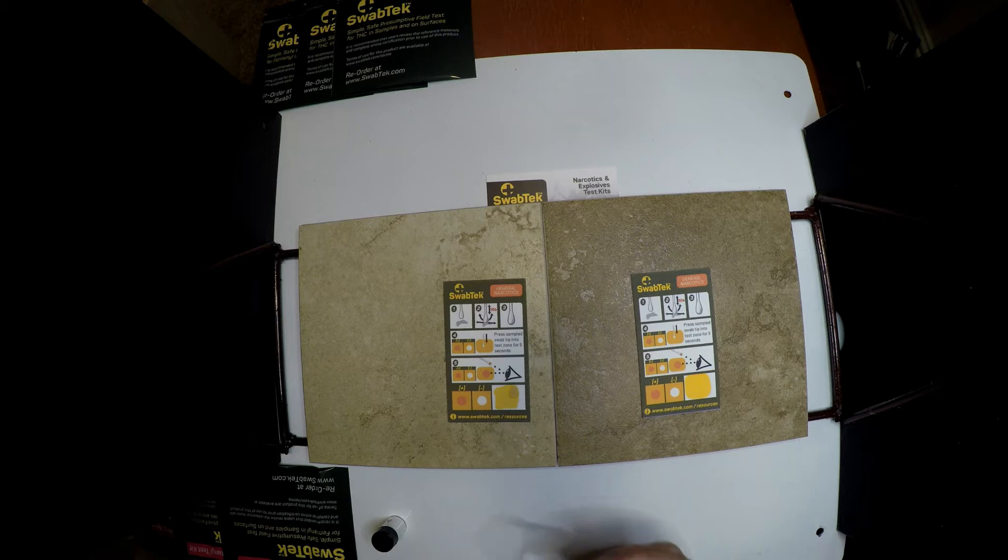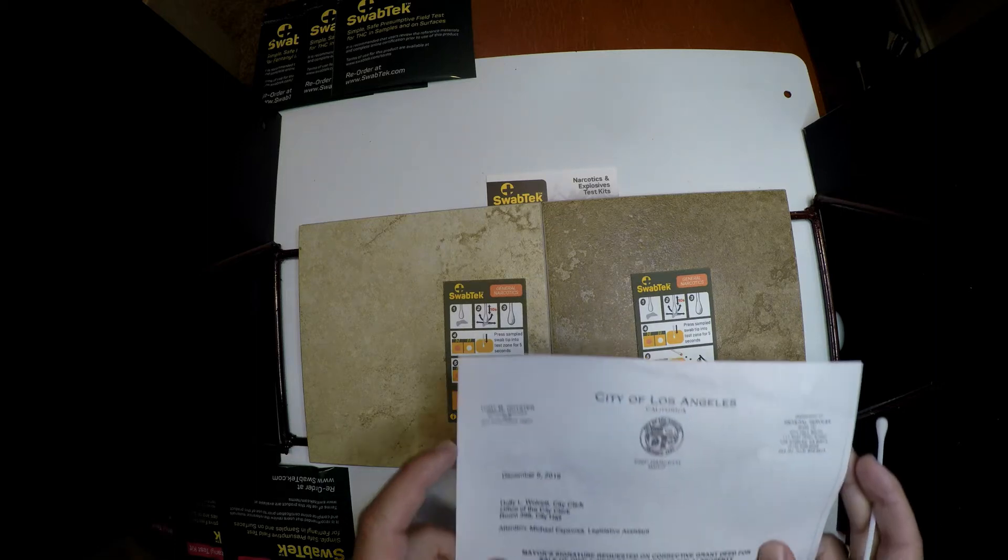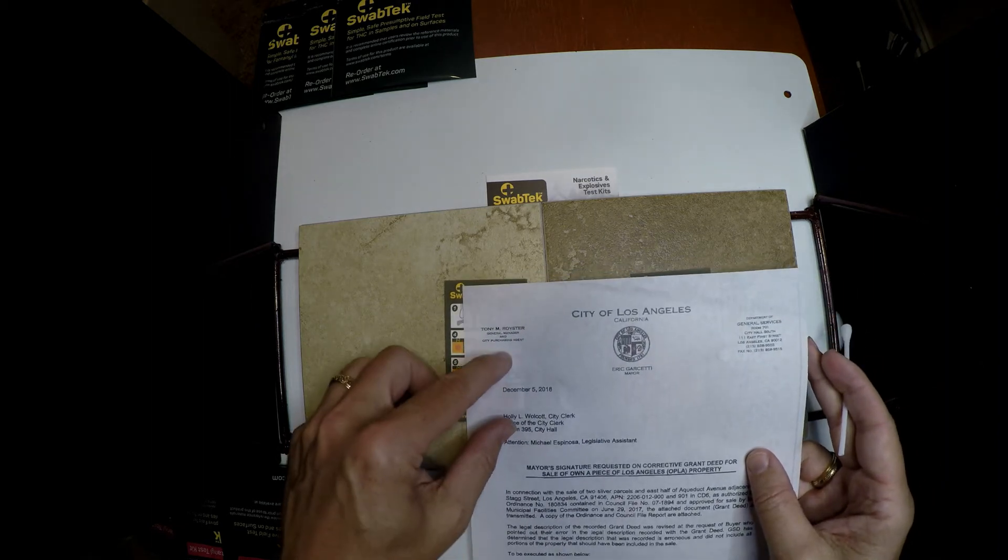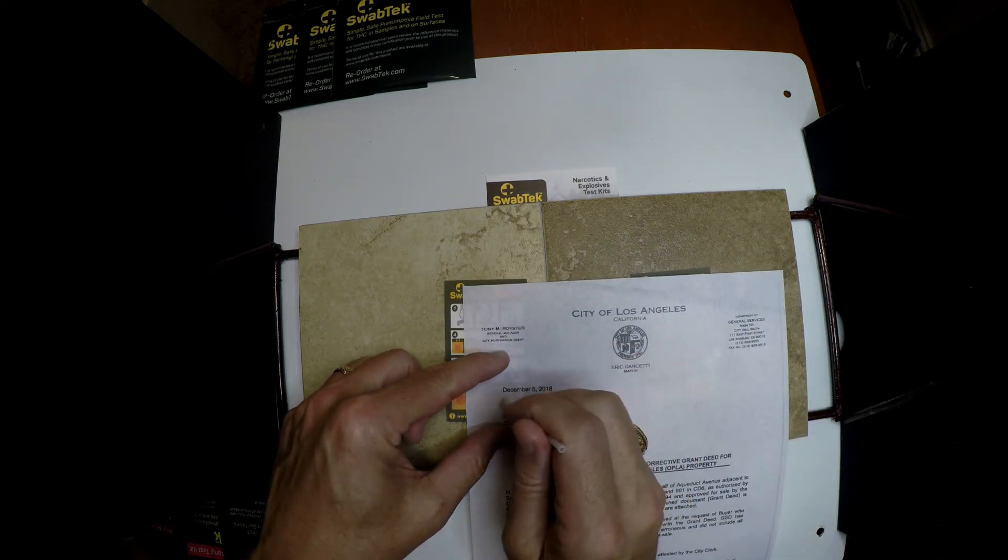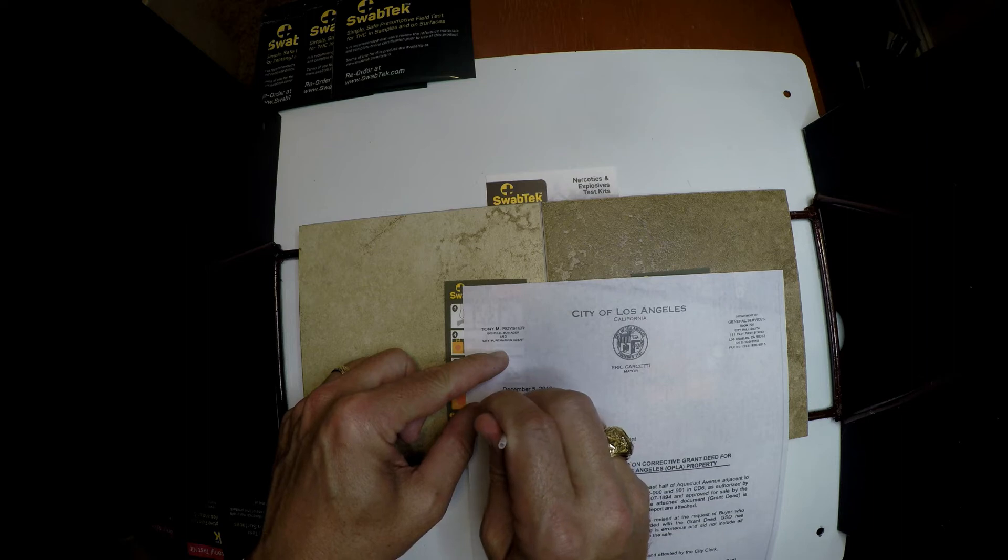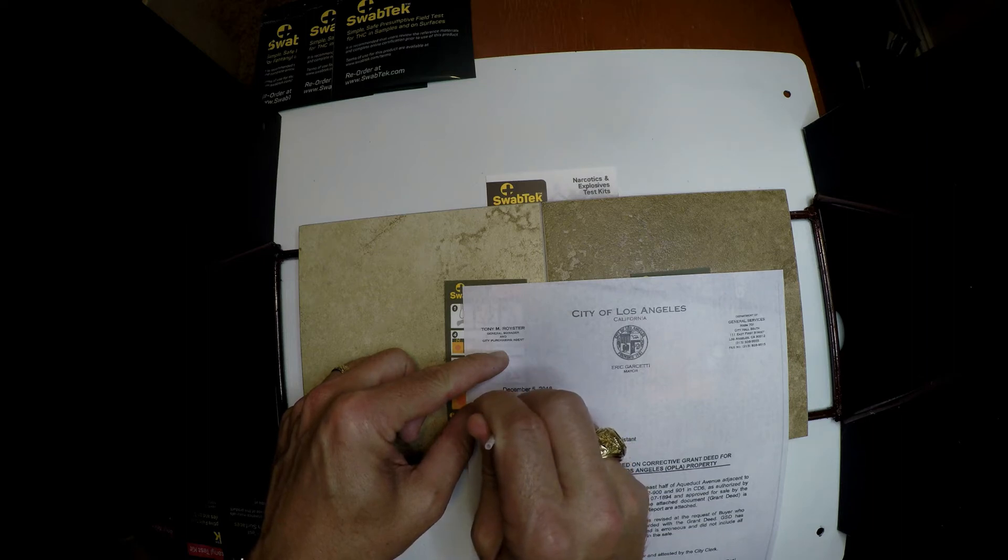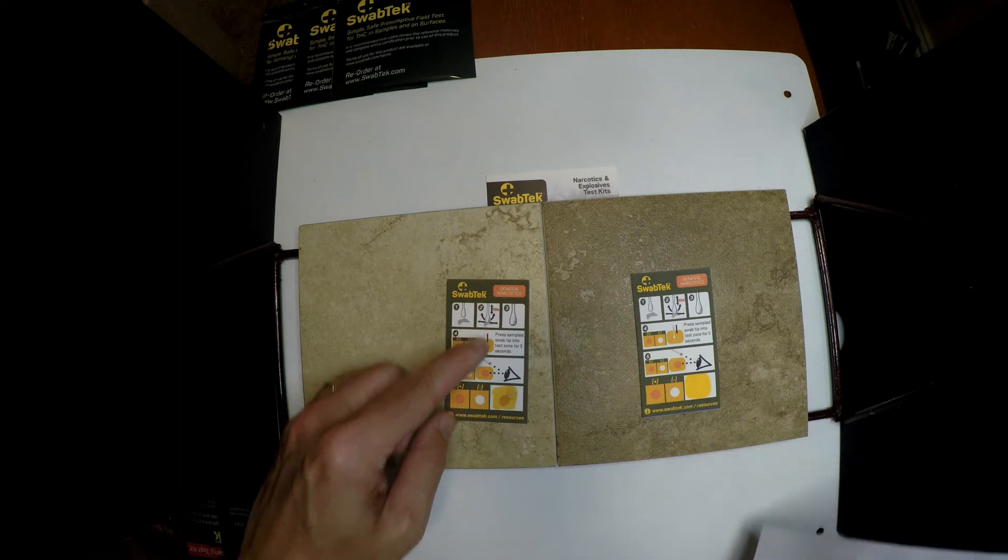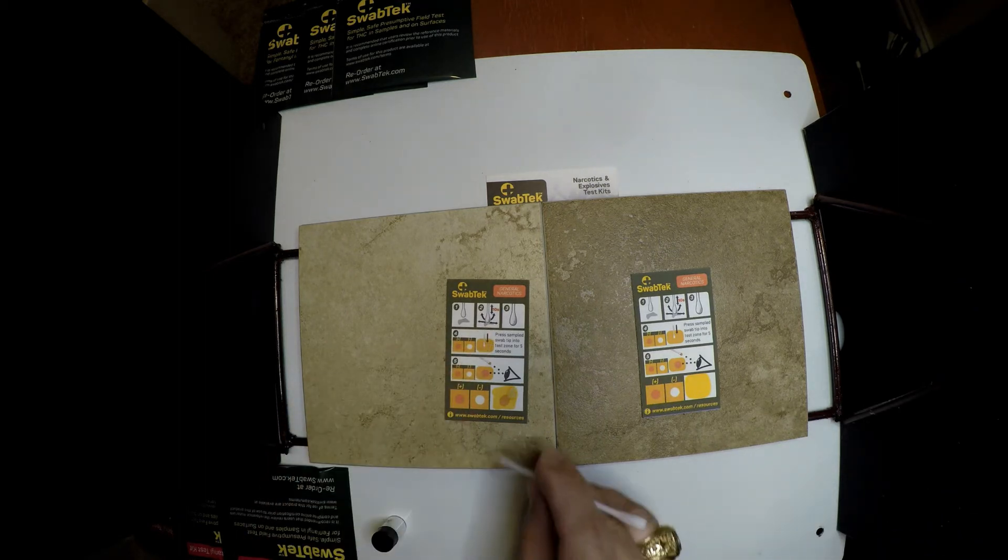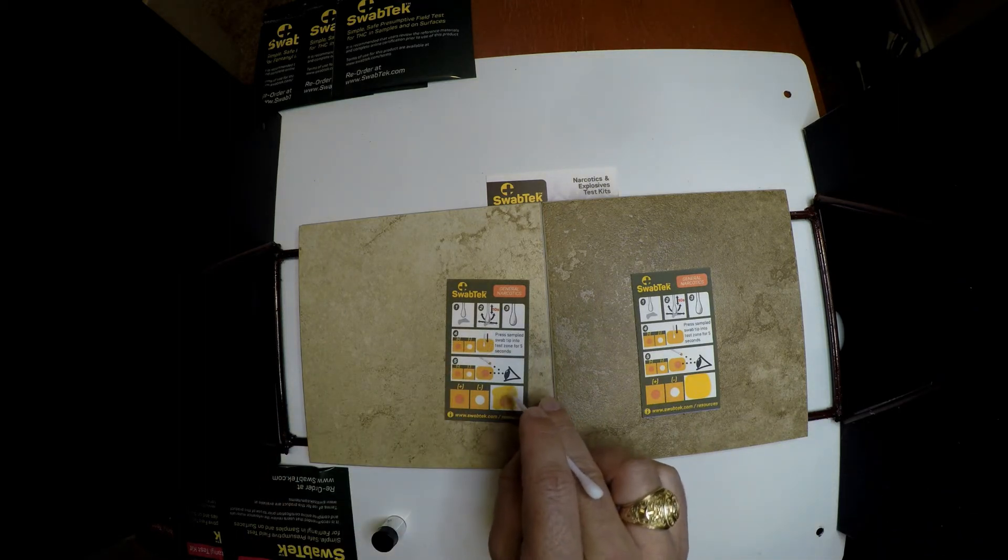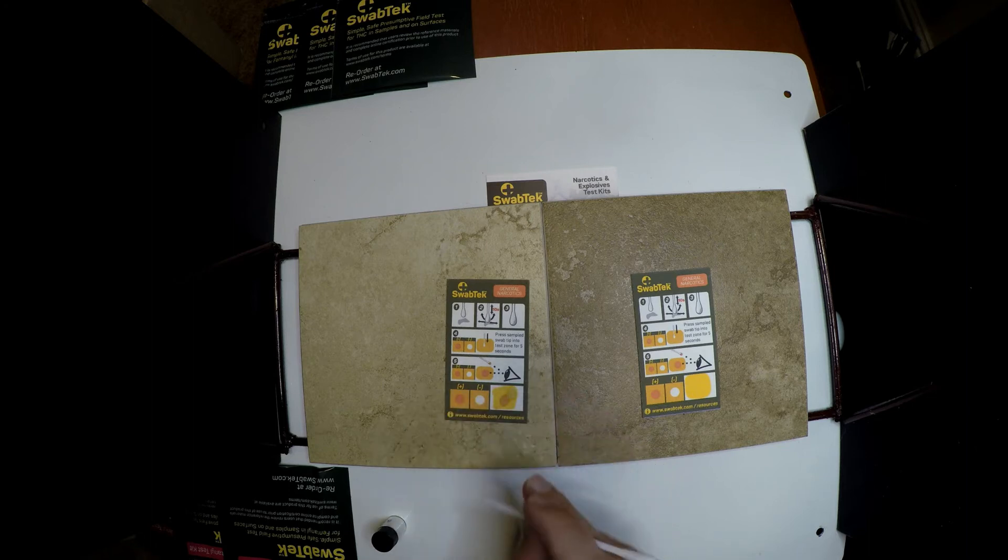If I take a piece of paper that is impregnated with narcotics and I apply this, I get an orange dot. This is a positive. This is a negative. It's as simple as that.